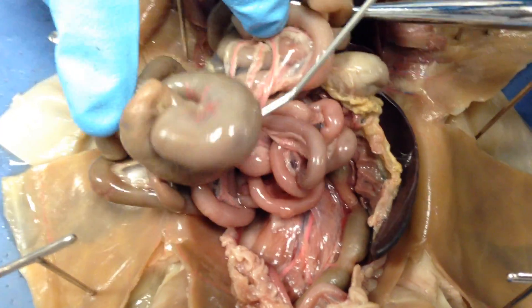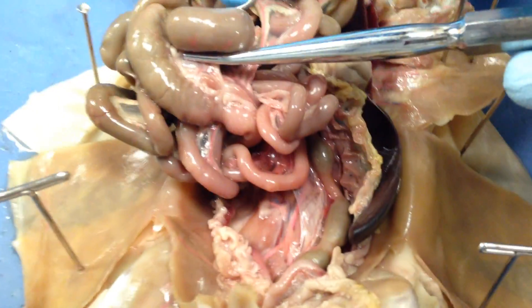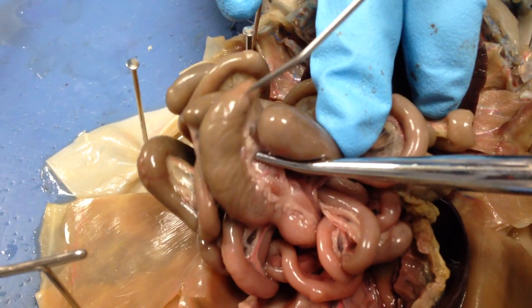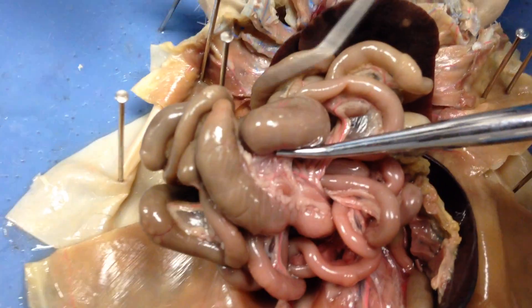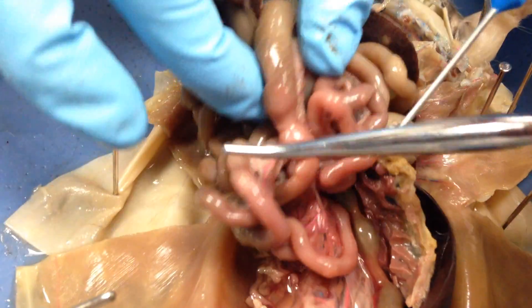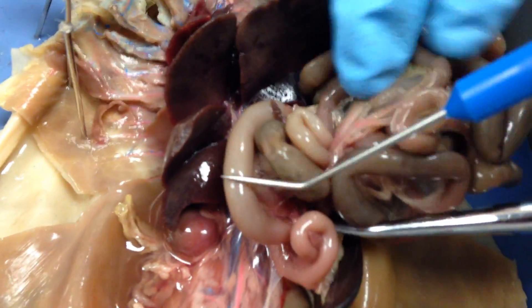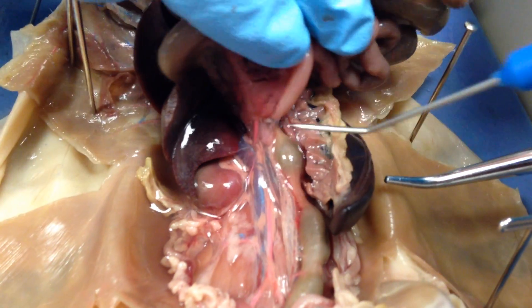Then you get to your cecum. After your cecum you have your colon — the colon is right in between your cecum and your large intestine; don't take my word on that, make sure you look at that one again. That's something to double check — fact check me on that. When you get past all of this, you have your large intestine starting here, it's a little tangled, all the way down to here.